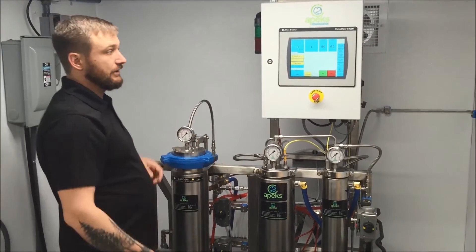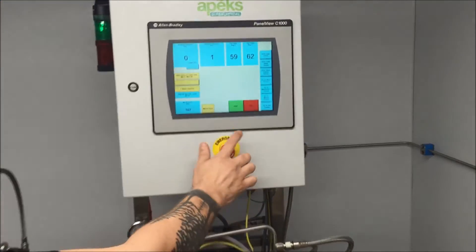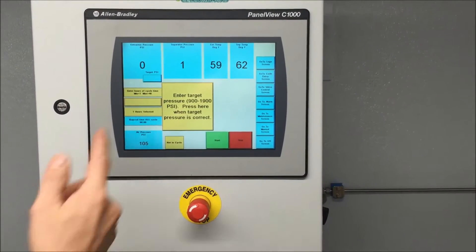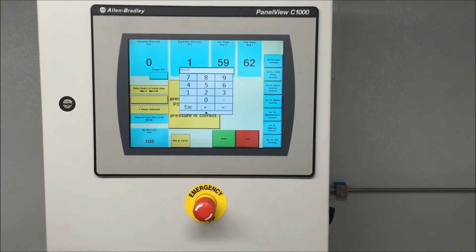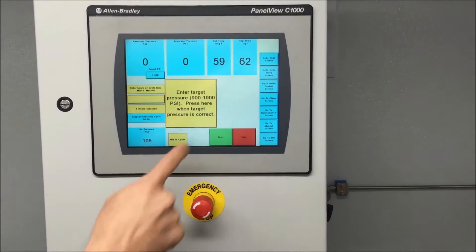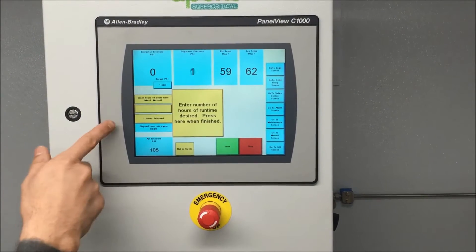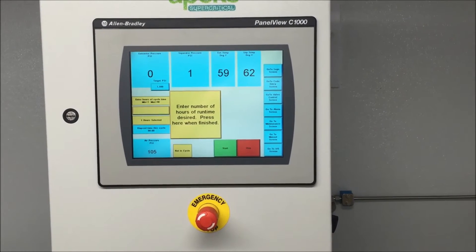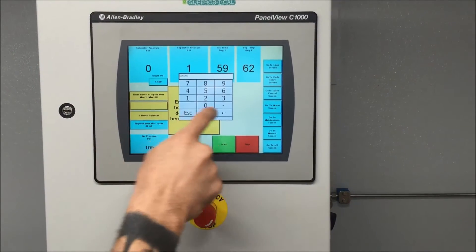Once you get your plant material in there and secured, you come over here. All you have to do is hit start and it walks you through everything. First thing it asks us is to enter a target extraction pressure — I'm going to enter 1,500 PSI. Then it asks us to enter run time. As I mentioned, two to three hours per pound of material, so if we had three pounds of material in here, we would put six to nine hours.